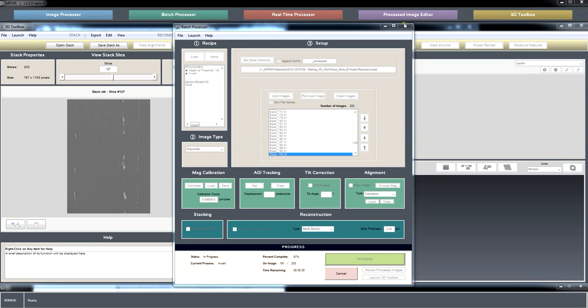Yes, oh yes, we were using that exclusively before we developed this. Sure, definitely. We like to think we've done that and then some with the interface. If there are additional features of Fovea that you do rely on that you don't see here, we welcome that feedback and can try to add those in.